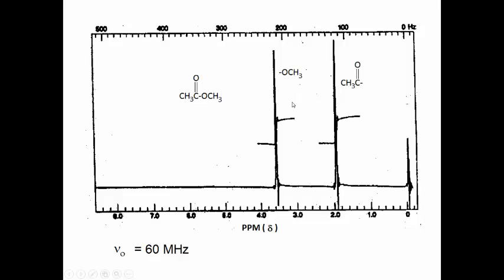After obtaining the spectrum, you put the instrument into what's called a peak integration mode. And in one approach, what the instrument does, or the computer associated with the instrument, is to draw a stair-step line at each NMR signal. That's what we're seeing here. It turns out that the height of this stair-step line is proportional to the peak area.